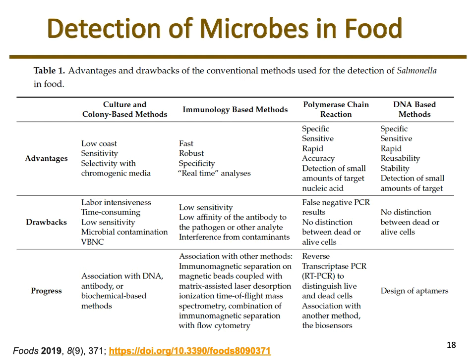Also, a lot of times it doesn't account for the viable but not culturable aspect. And so as far as progressing that area, looking at association with DNA, antibodies, and chemical-based methods, which kind of leads you into saying, okay, culturing methods aren't really great. Let's look at immunological-based methods. So next column, right?